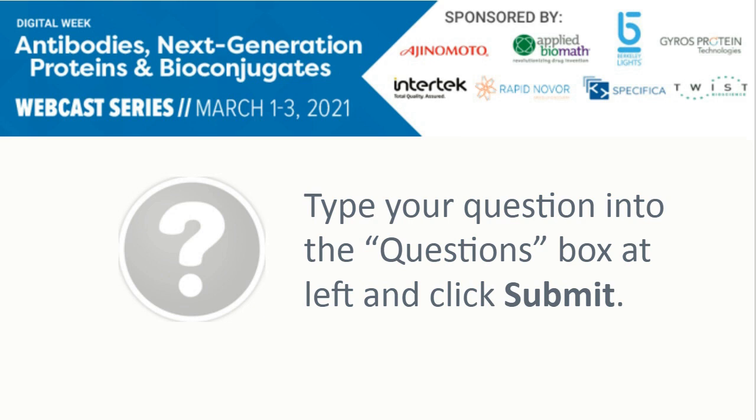A couple of things. The first problem is that mice are physically very small, and the amount of material that we require to run the RePAB workflow, specifically for the proteomics, often requires at least 1 milligram of affinity purified IgGs. That can be tricky to get out of a mouse for obvious reasons, right? And so for that reason, we've been hesitant to work with them, but it's something that we're keen to explore.